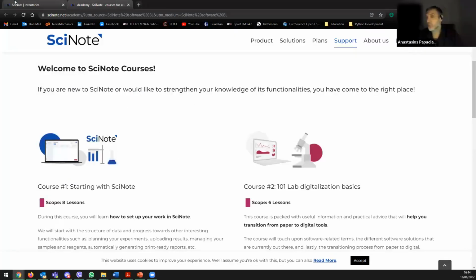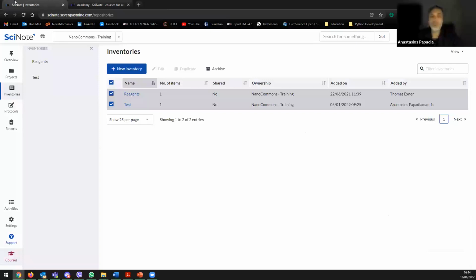Else you can more or less wait for the next hackathon, where we will play with all the things that we said: importing data, uploading data, importing protocols, fixing the data template, and so on. It's hands-on practice, and also a bit more advanced things, like how do I move around projects, teams, etc. That's it, more or less, Martin.